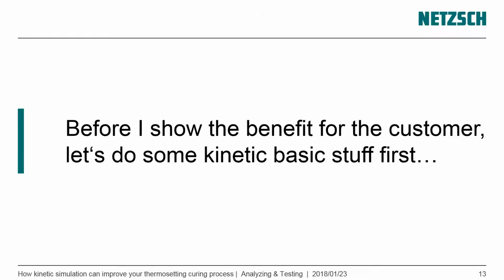But before I show you the benefit for the customer and the results we could generate for him, let's do some kinetic basic stuff. So now we will talk about what is kinetics, how to use kinetics, and then I will show you again the query of the customer and how we could solve it.